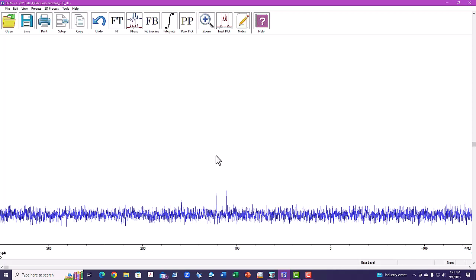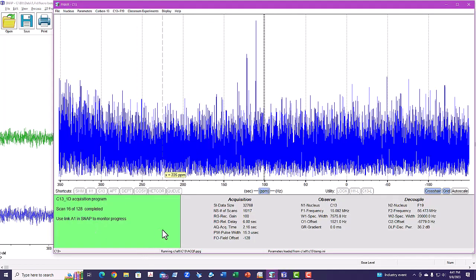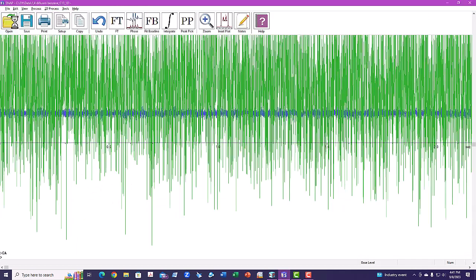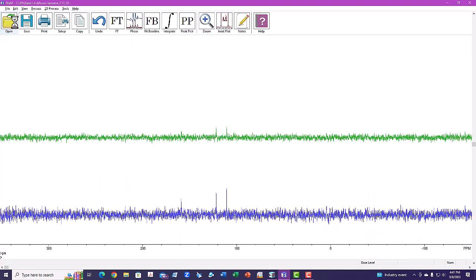This was the data after about 10 scans. Let's just take a look. 6 scans. I'm going to load the buffer with the AL command and DD, do a dual display, just so I can keep that on the screen and see what it looks like after I process the data again. And I'm going to do that. In the meantime, it has now acquired 16 scans, so we'll open up that file again. And we do BC, EM, FT, phase same.